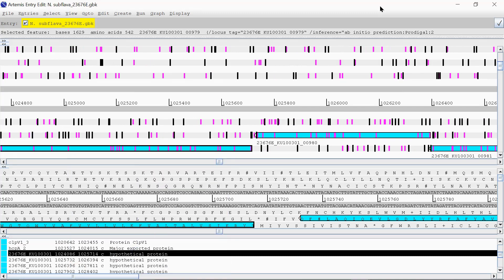That's just a few ideas. If you do struggle, there are resources out there that can help. I think this is quite a good one. This is very useful for annotating the genome to identify the coordinates of the gene.